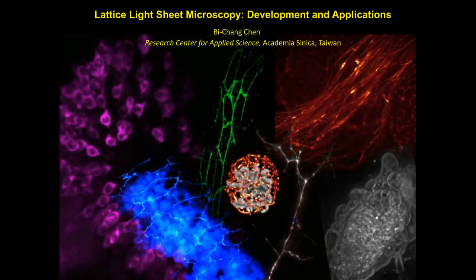Thanks for the introductions. It's my great pleasure to present the research that I have done in Dr. Eric Betzig's group. The project is Lattice light sheet microscopy, and I will focus on how we developed the technique and what the applications are. Lattice light sheet microscopy is simply for 3D live fluorescence imaging.